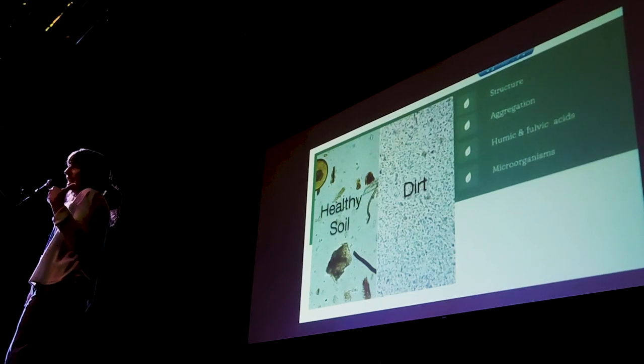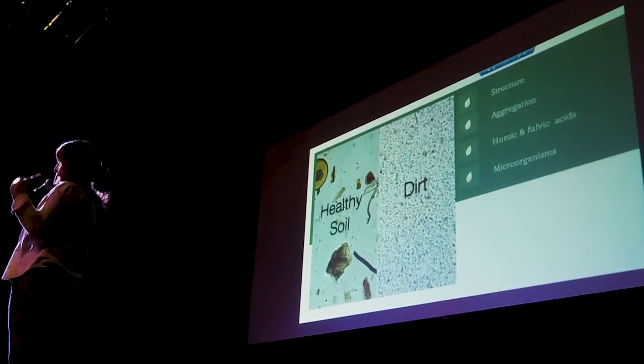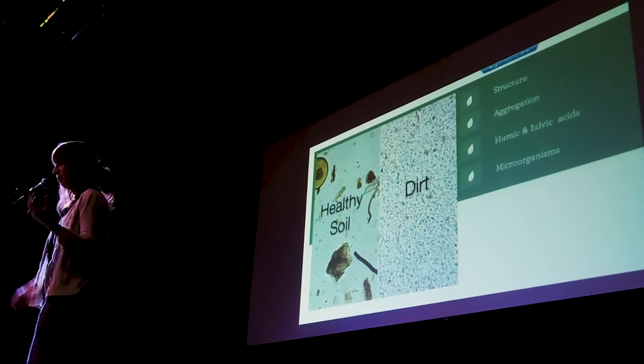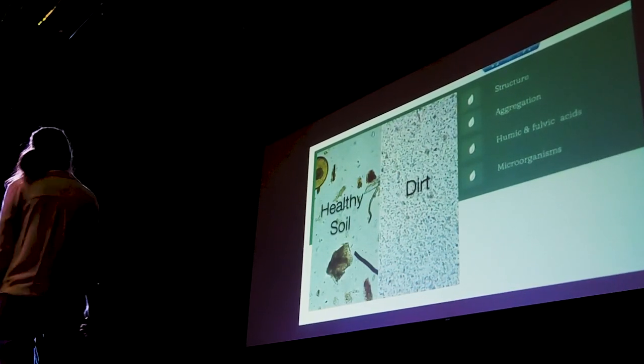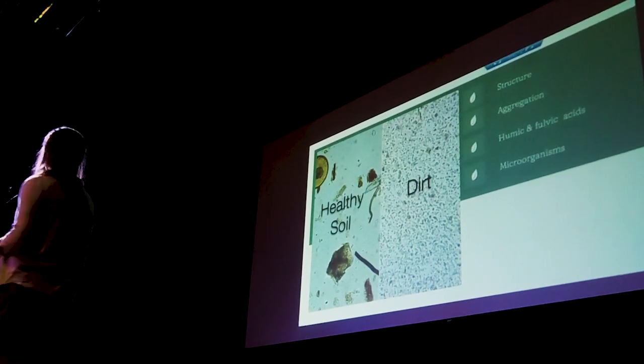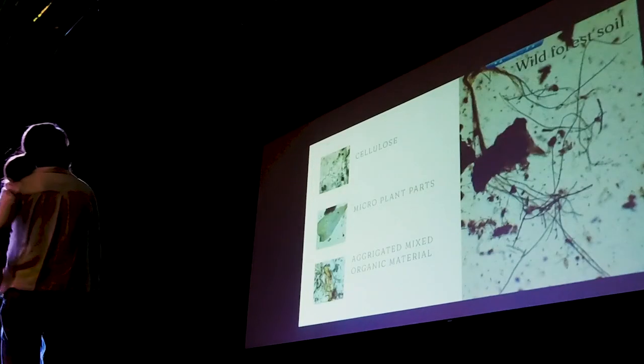There's a lot that we can conclude from just looking at one view. And now imagine if you just keep going. You look at 25 different views, you look at 100 different samples. Before you know it, you start to get a feeling for the microbial world and what you're seeing. Although you always have to remember that you really don't know, so it's a guess.